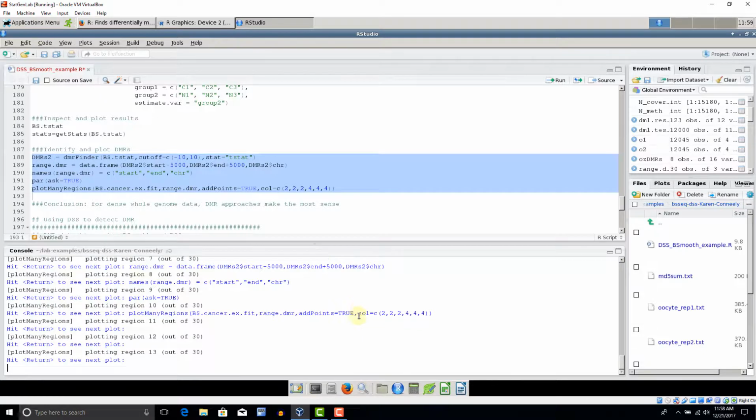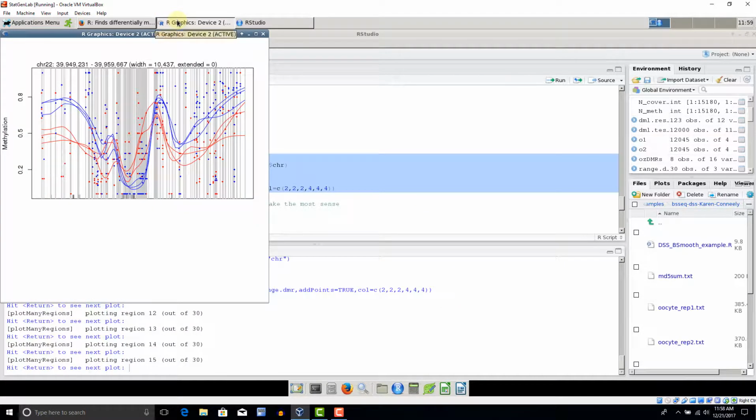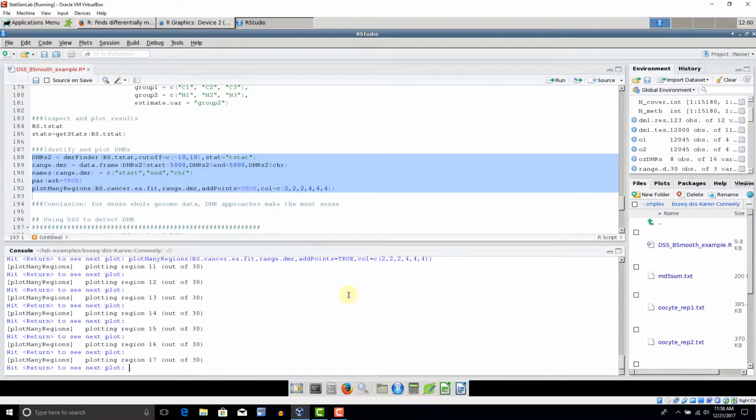Now we're tending to find these bigger regions where there's a lot of hypomethylation. The corrected t-stats were designed to edit that out. And this one looks really different, actually. It still looks like CpG islands, but it looks pretty different.